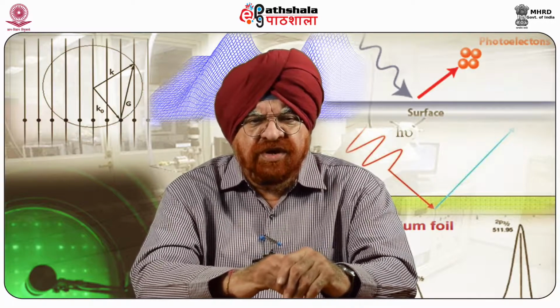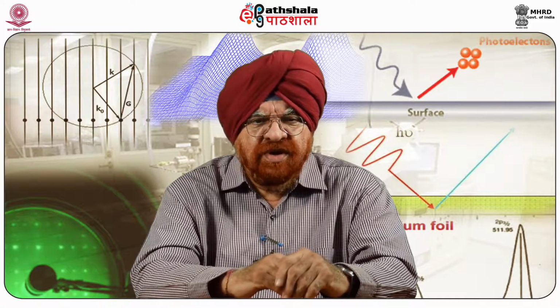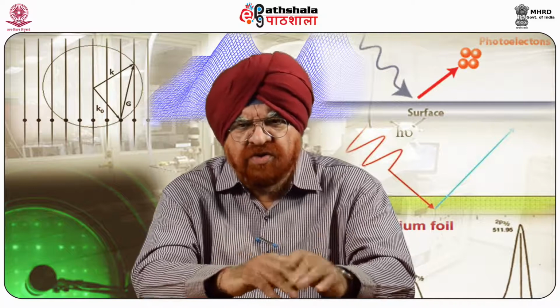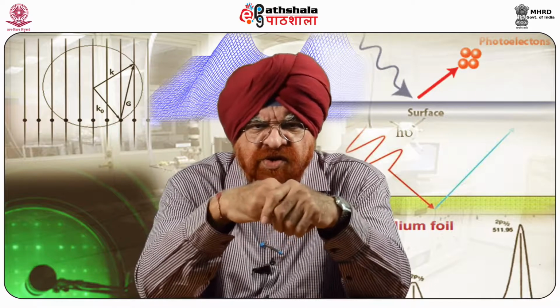The technique is an offspring of AFM. That means it is similar to what we use for AFM. It's a sister technique to AFM, we can say. That's why sometimes we say that this technique is an offspring of AFM and employs a sharp magnetic tip attached to the flexible cantilever, as we find in the AFM technique also.